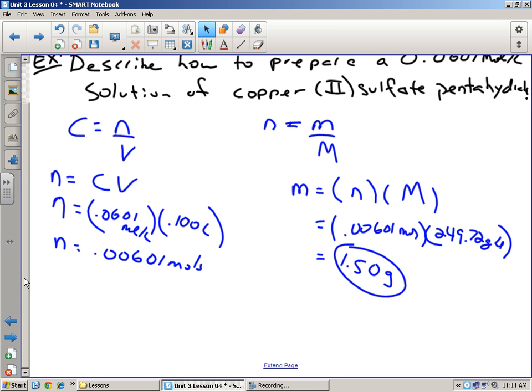I'm going to cover it with a stopper. Make sure it snaps on there good. Oh, that's a good one. If you snap that lid on and you can turn it, it's going to leak. I'll tell you right now. If you can spin it like this, it's not tight, and no matter what you do, something's going to leak out. I knew that, but I didn't have a choice, because some of them fit really well, some don't. It's just luck of the draw. This one fits really well, so that's good.